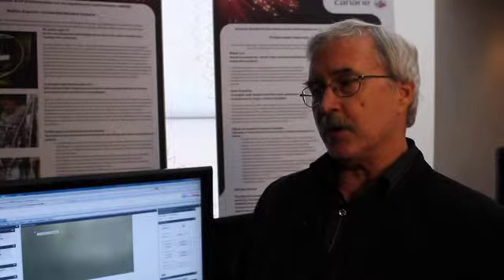Great. So what do you see as the next steps for this? Well, the next steps are to do a couple of things. One of which is to continue to work on the analysis software. We're hoping to establish a center where we have analysis software that can be used by synchrotrons running these kinds of beam lines across the world. We already have some interest expressed from the accelerator at Berkeley. So that's an obvious next step.